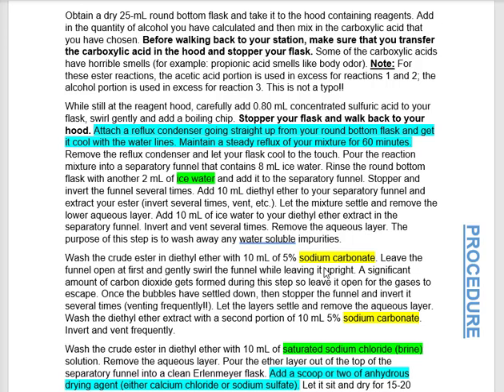Okay, the big thing here is you can't really say that the point of the sodium carbonate is to wash, because you've got all of this. If you think about it, you're trying to help remove water from the reaction, but then in the next set of separations that you do, you throw in more water. That should be a big red flag. Sodium carbonate here is not a drying agent. It's not meant to remove water. It's doing something else.